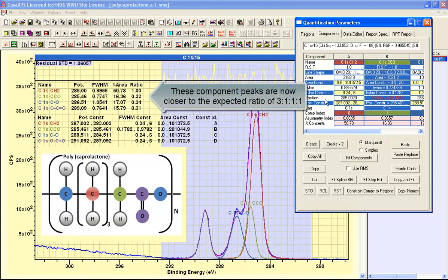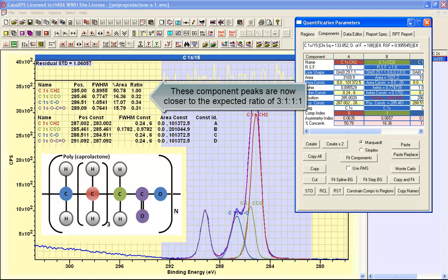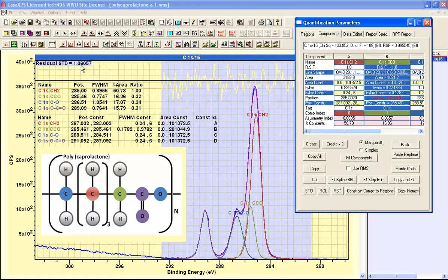I can end up with a set of peaks now where I can see the peak fit is, again, reasonably good, but the ratio of these peaks is now consistent with polycaprolactone.